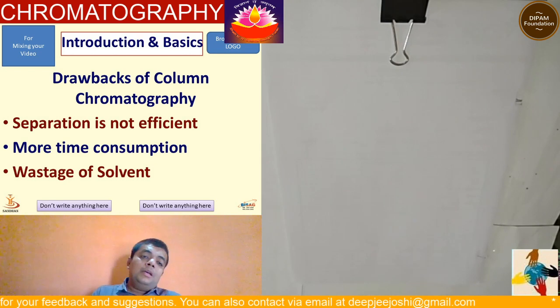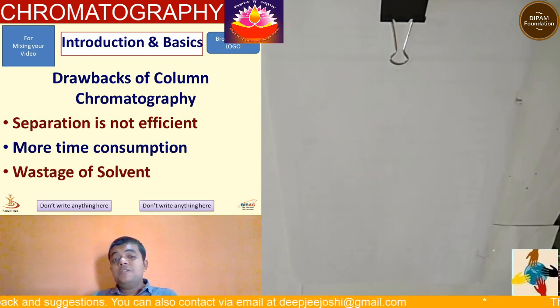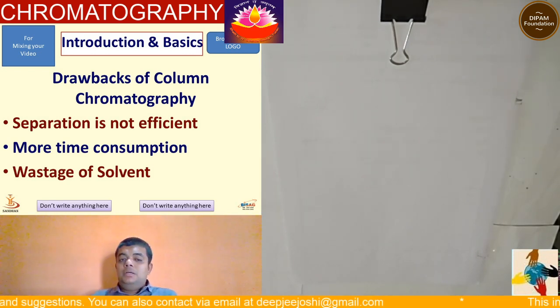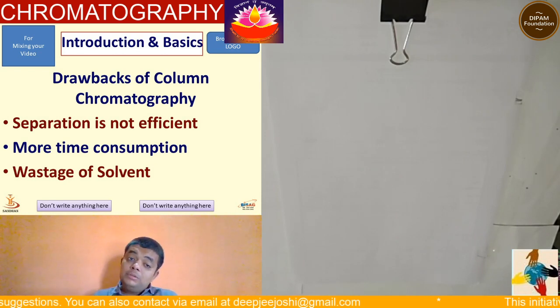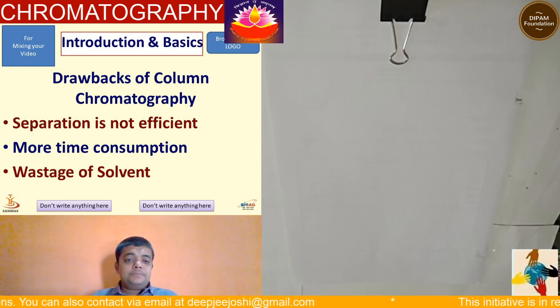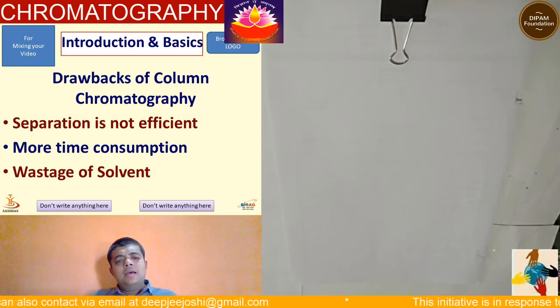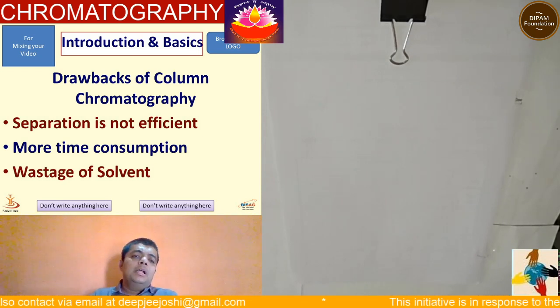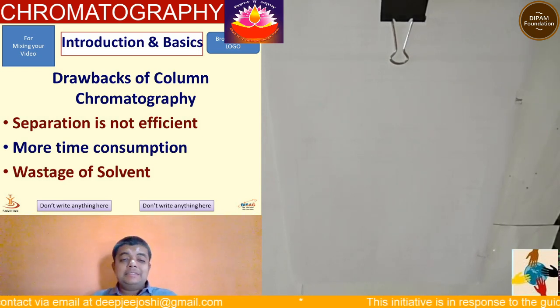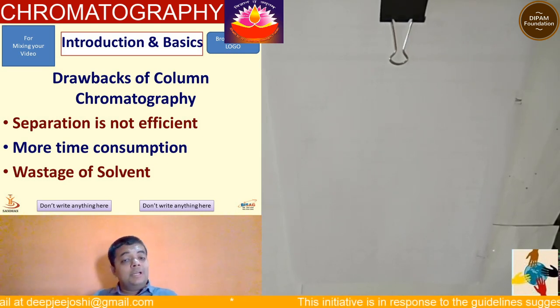how this column came into existence, what was the history of chromatography, we should now move towards the first two popular techniques that can be used both in the laboratory as well as in research, at BSc, BS level, MSc, MS level, or even at the level of research. And these techniques include thin layer chromatography and paper chromatography.